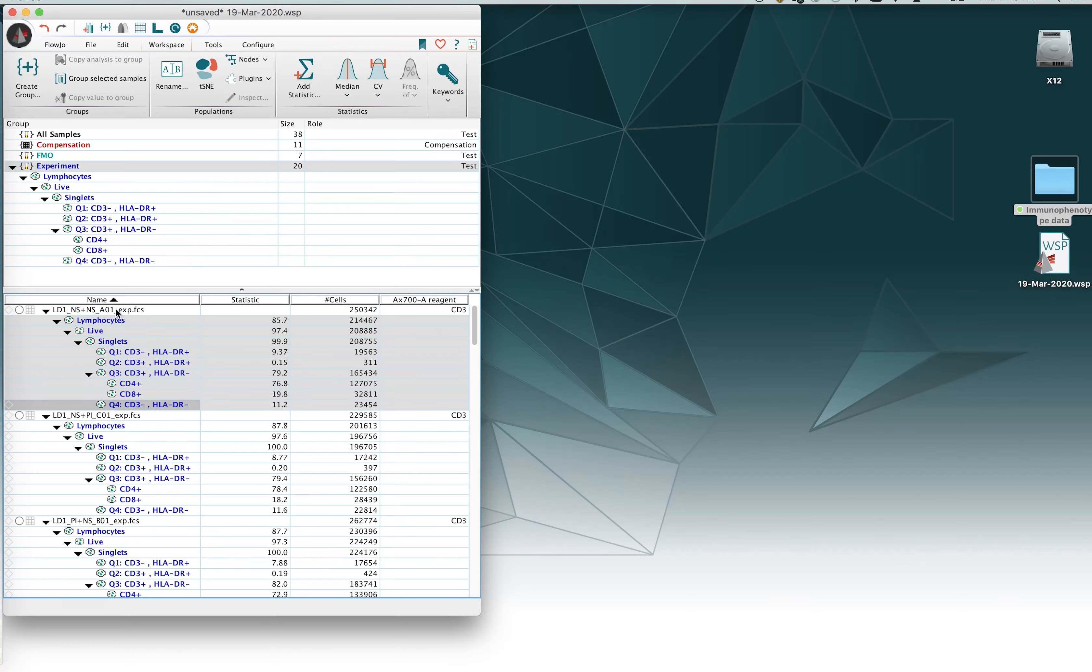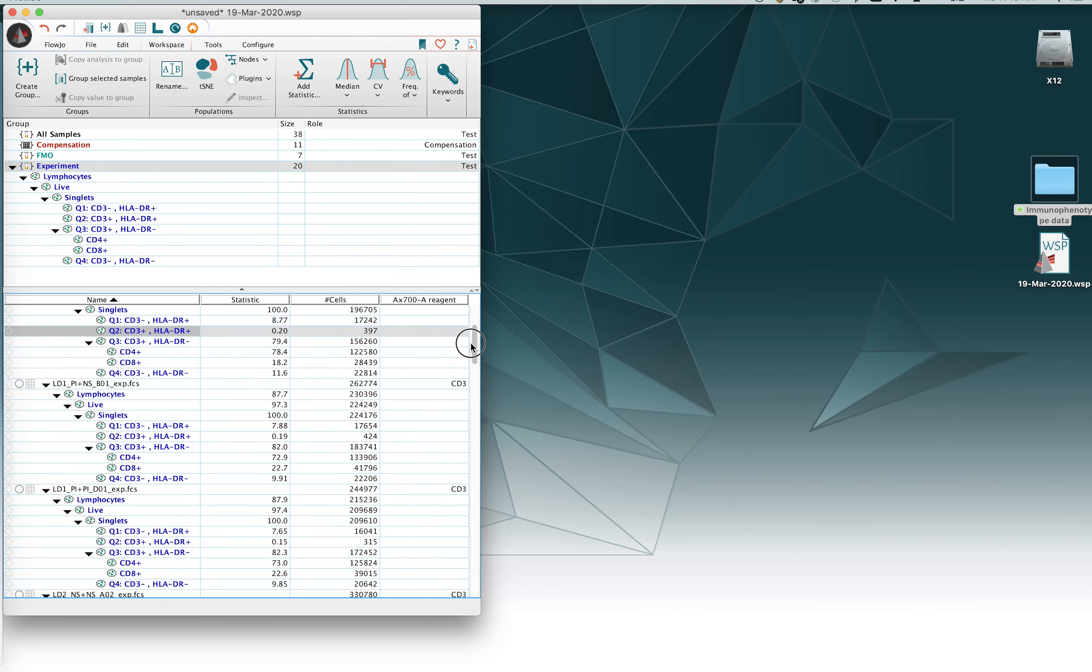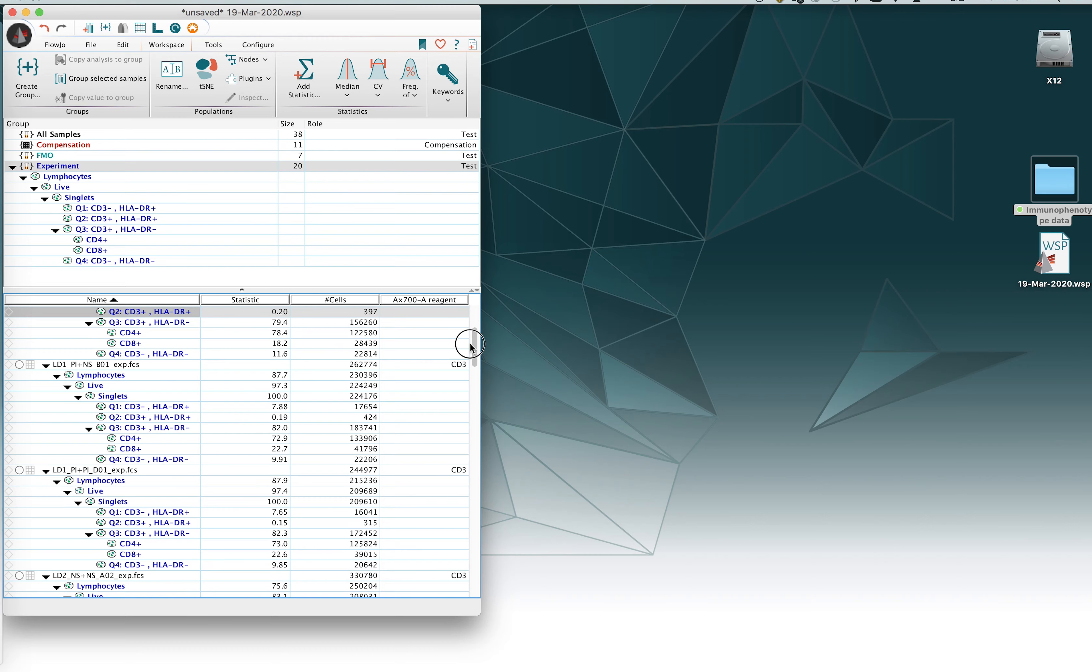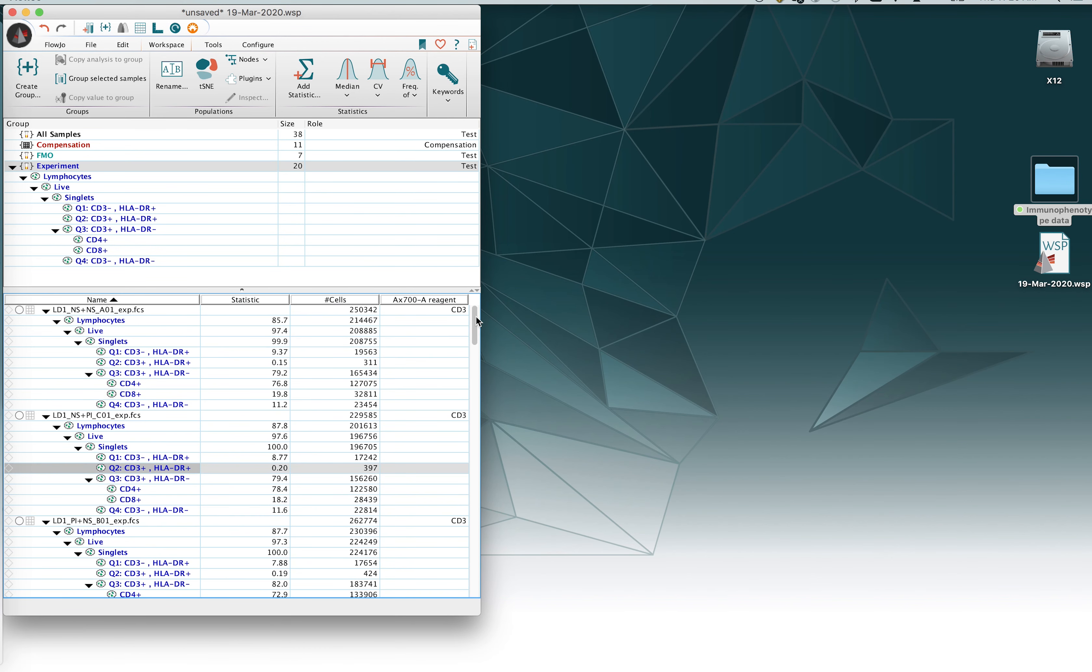And then from here you will notice that all of the gates now underneath each of the files are having that blue color.